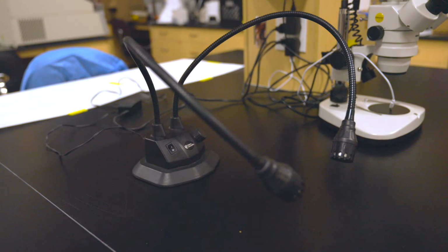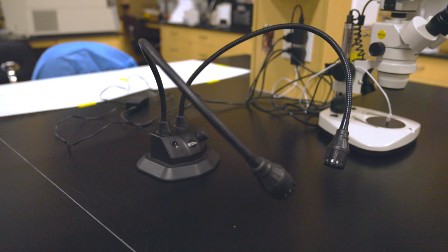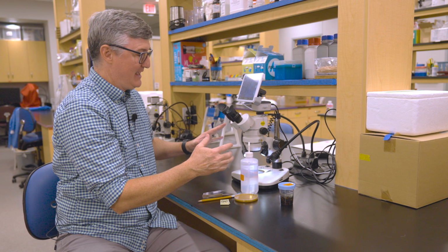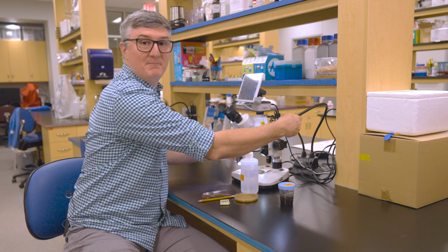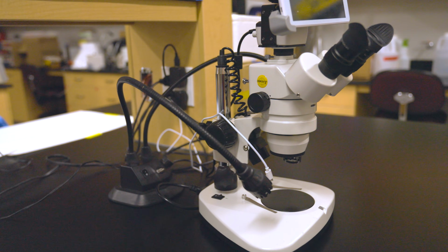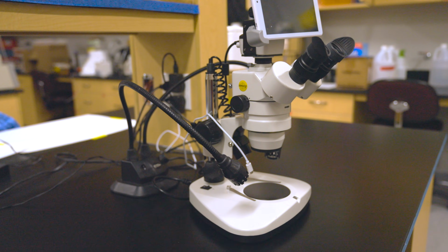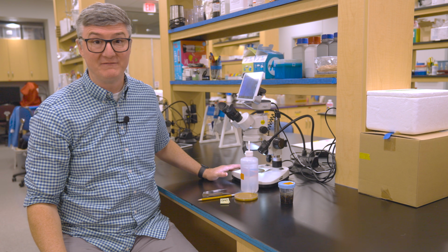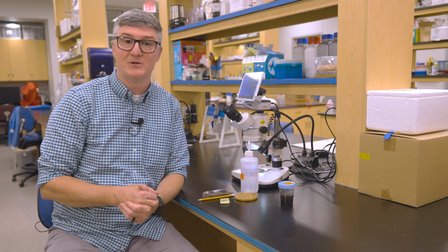These are called gooseneck lights because it looks like a long neck of a goose with these heads or lights at the end. And having these gooseneck lights make it possible for you to put the light where you need it to be while you're looking through the microscope for dissection purposes. Now, admittedly, these can be expensive. They can be $500, $1,000, $2,000 or more.